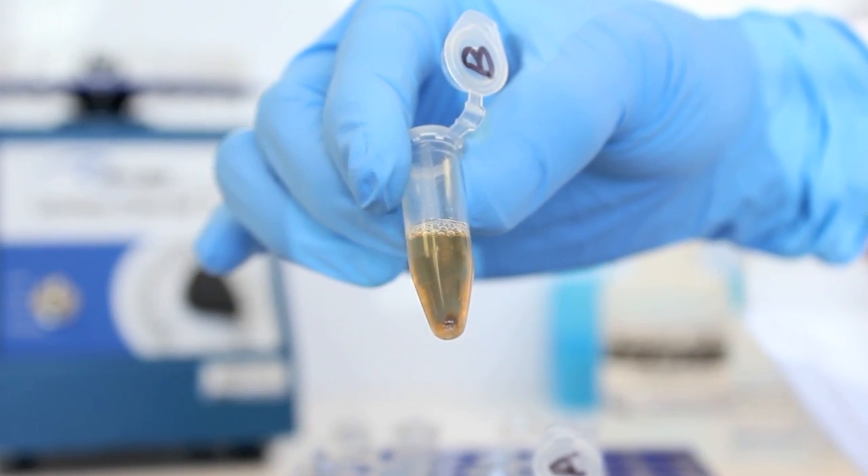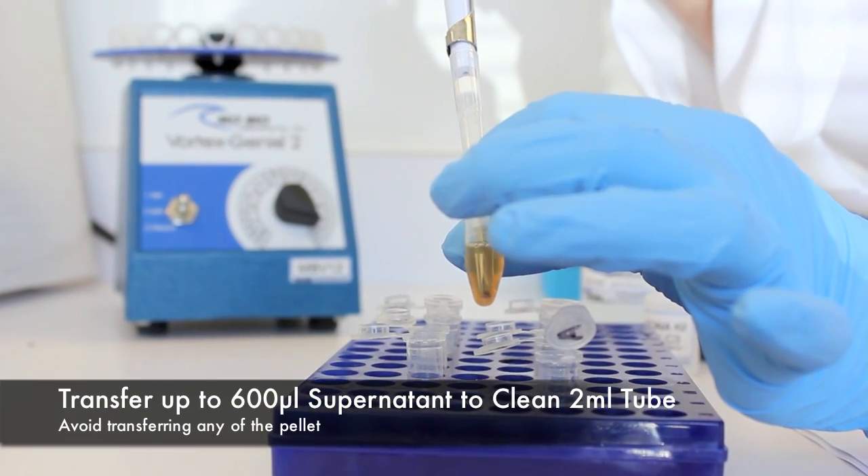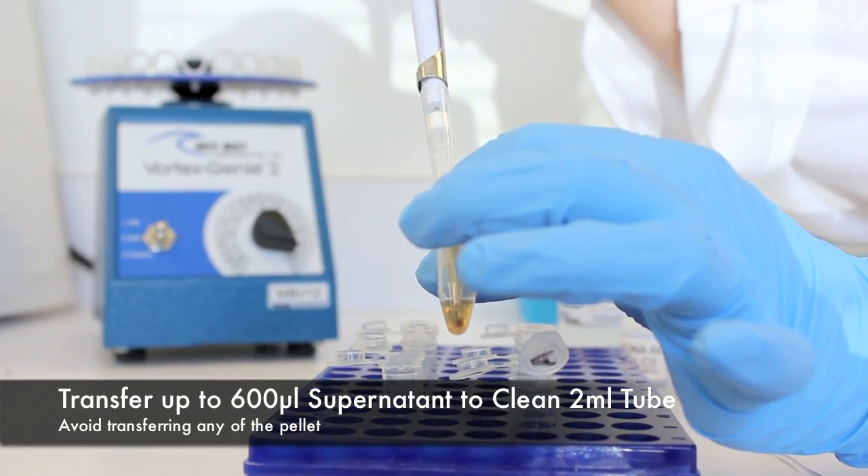Avoid the pellet. Transfer up to, but no more than 600 microliters of supernatant to a clean 2 milliliter collection tube.